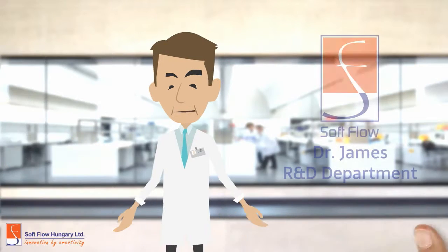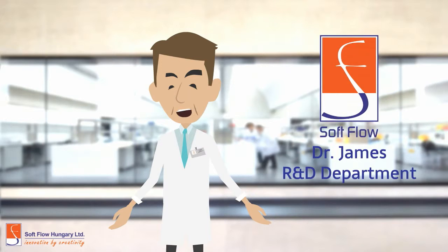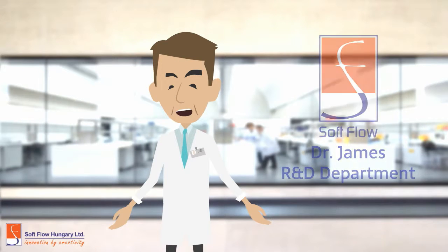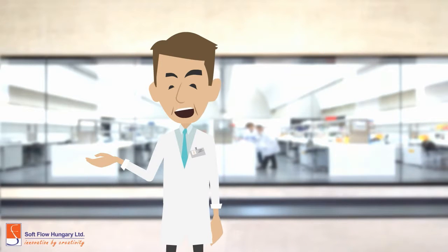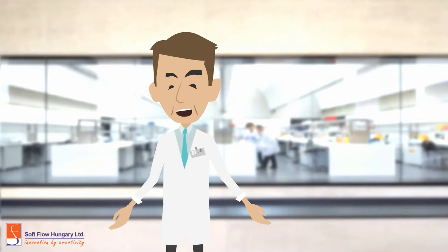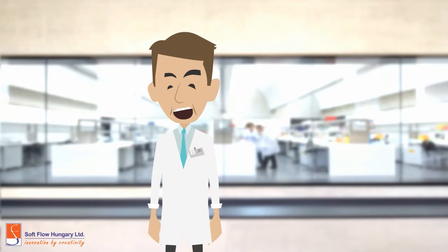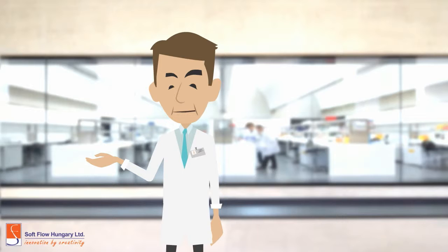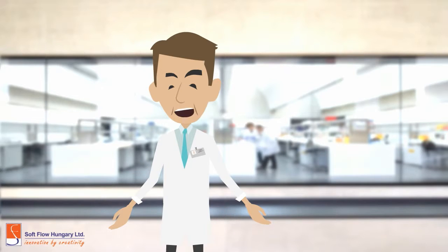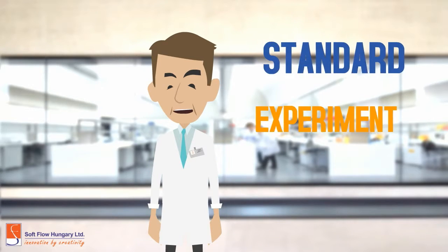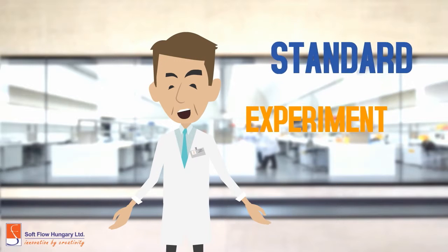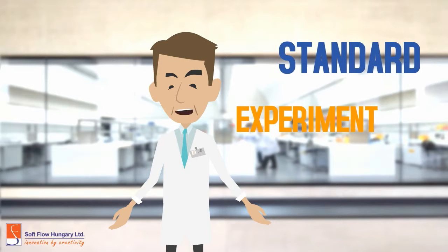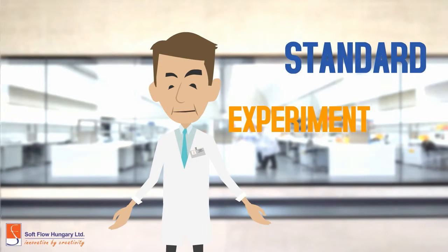Hello. I am Dr. James. I am glad you chose FCAP to analyze your flow cytometry data. In this video, I am going to explain the steps for using FCAP. To explain the steps, I am going to use a standard experiment retrieved from our lab. Take a look.